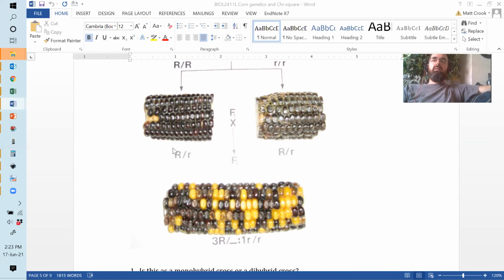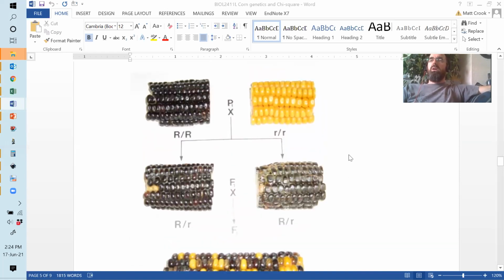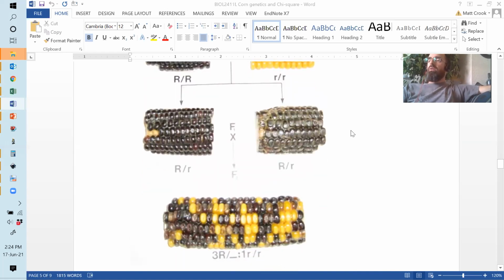But we don't care about whether these plants are male or female in this because we're not dealing with a sex-linked trait. And so I think what you're talking about is the expected values. So if we do a monohybrid cross and we count the kernels in the F2 generation, the ones at the bottom here, and another tip as well, if they have even the slightest bit of purple in them, they're purple.